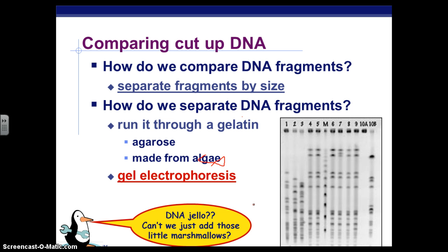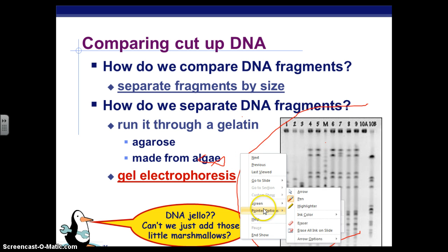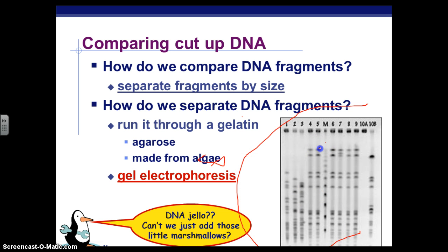And you'll see these gels on Wednesday. On Wednesday, you're going to practice what is known as loading a gel. And inside the gel, you can't see these, there are tiny holes that allow the DNA to travel down the gel. Because there are holes, these smaller fragments are able to travel further down the gel, and the larger fragments can't travel as far. So if you look at this gel that we have right here, you can see the darker fragments. These fragments here, so this is a strand of DNA, or when there's a dark spot, that means there's DNA there.